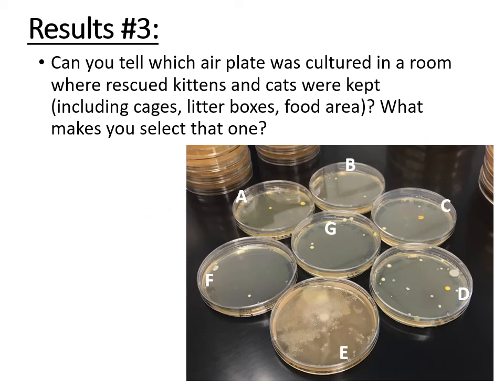Okay, one of them picked a bathroom, one of them picked the stairwell, one picked inside the classroom, various different places, but all I'm telling you is that one of them was placed in a room in our building, this was at a different campus, where the owner of that room kept rescued kittens and cats, meaning that there were animals in there, there were litter boxes, there was cat food and everything in there. So looking at these results, all of these different plates, I want you to try and figure out which one do you think was where the animals were.